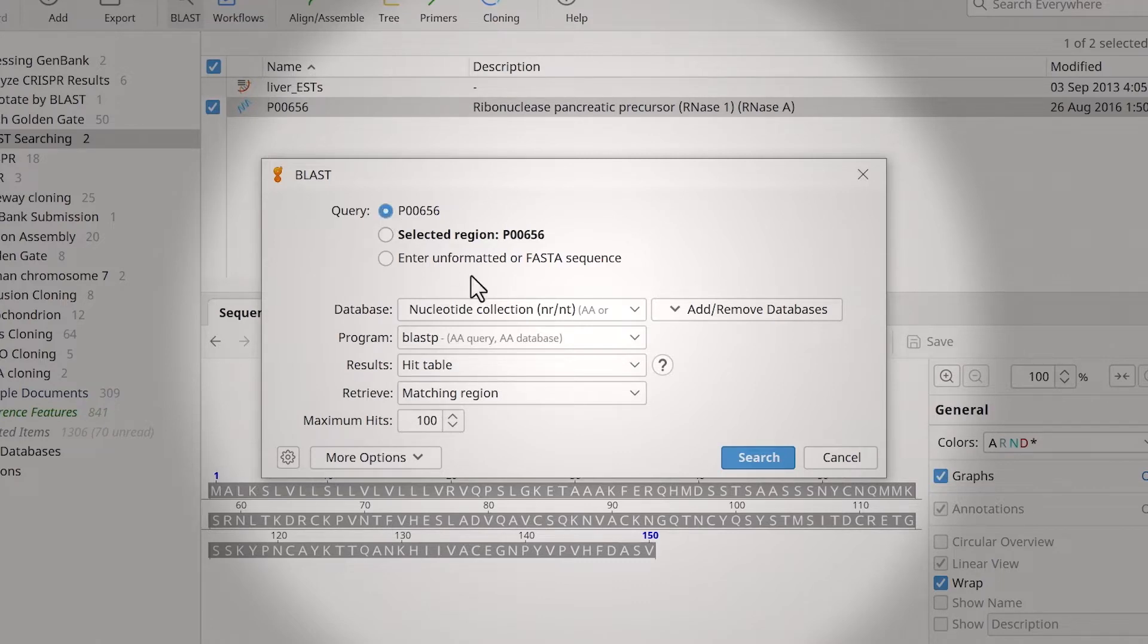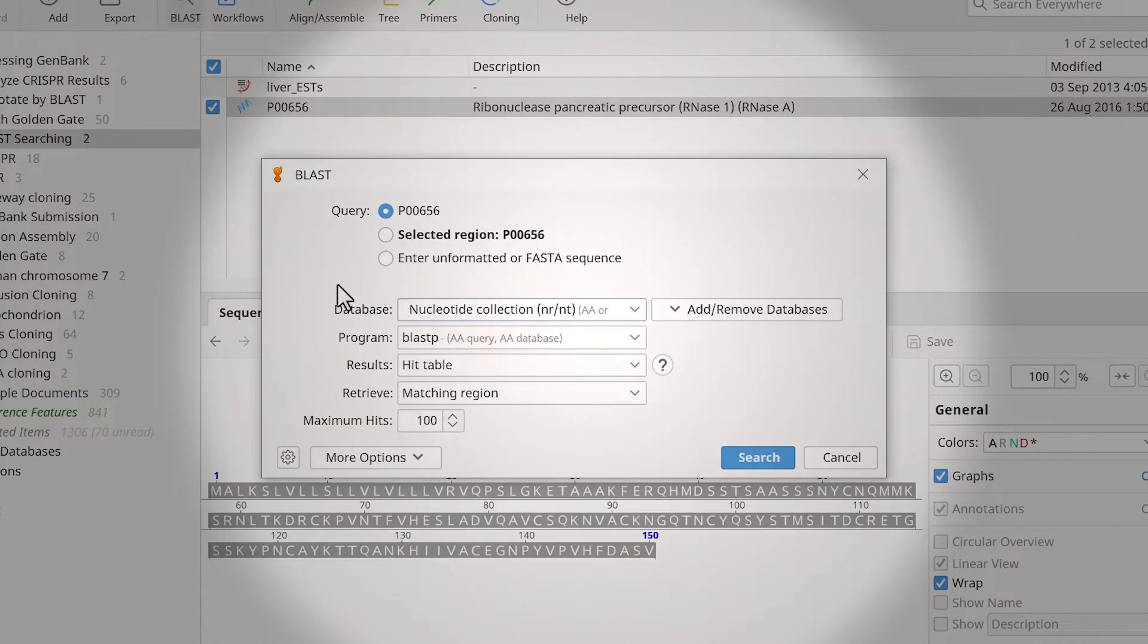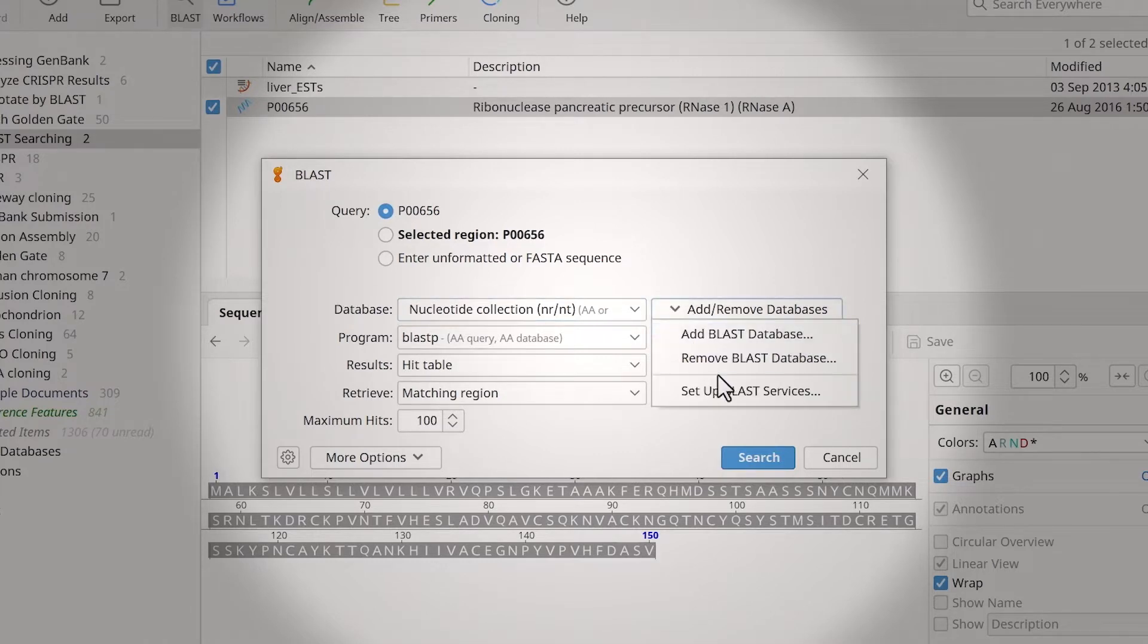To specify a different database, use the drop-down menu. If your database of interest isn't in the list, you can also create a custom BLAST setup.